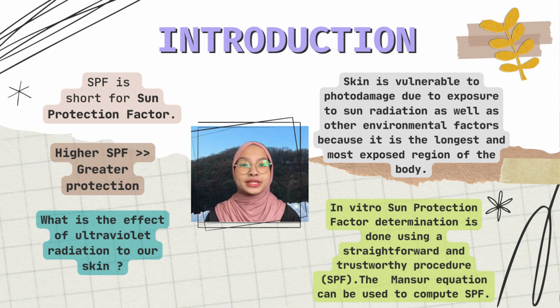So now I will present about the introduction of our mini project, which is the determination of SPF value of sunscreen. Do you know about SPF? SPF is short for sun protection factor. Each sunscreen product has a sun protection factor that tells you how much protection you will get from UVB rays, with a number denoting the level of protection. A product with a higher SPF will offer greater protection, while a lower number will offer lesser protection.